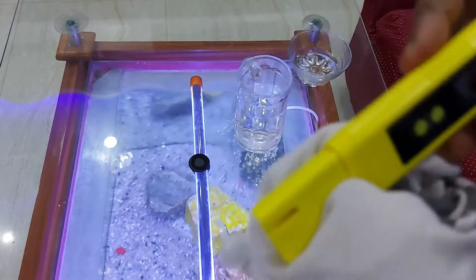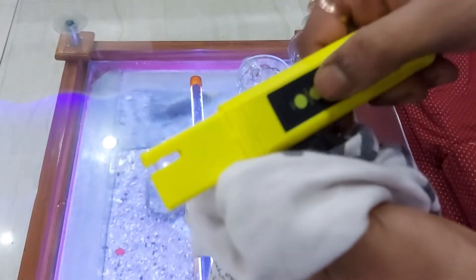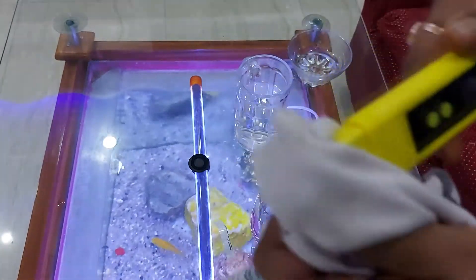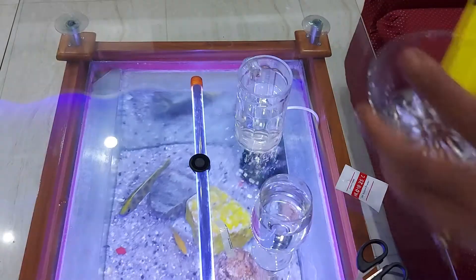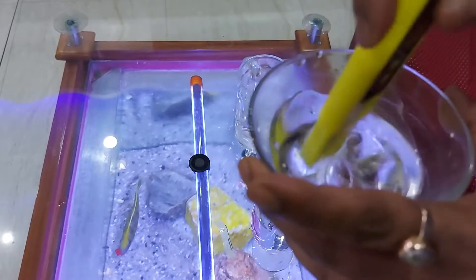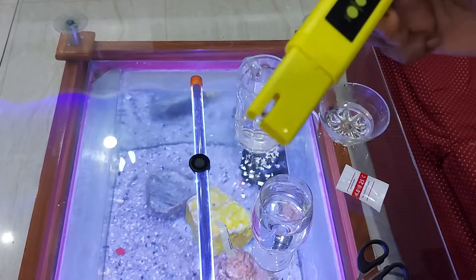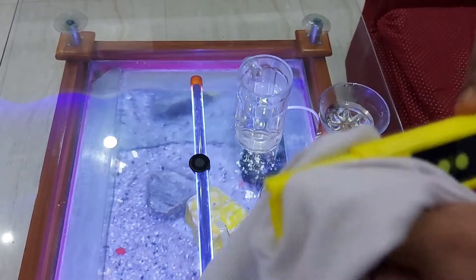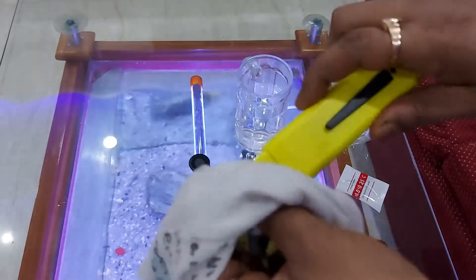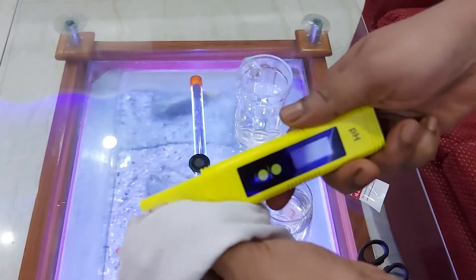Now we have to clean the tip of the pH meter with a clean filter cloth or a normal clean cloth — just clean the tip where you submerged it in the water. Then take the clean water and rinse it just a little bit, and again clean the tip with a clean cloth.